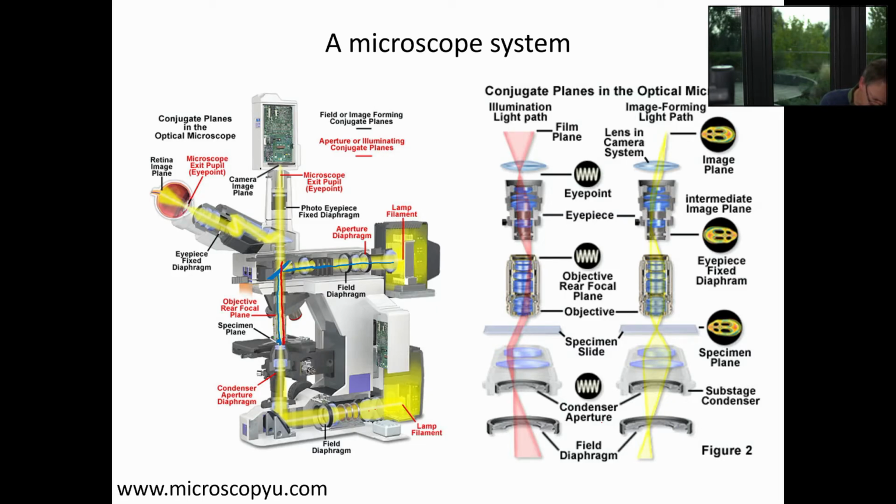It passes through the dichroic and then goes through the tube lens, and you form an image on the camera chip. And usually there will be some filters in there as well, the emission filter. Alternatively, again, you can slide in this prism here and then send the fluorescence signal onto your eye if you want to do that. And again, you can see that this is an upright microscope.